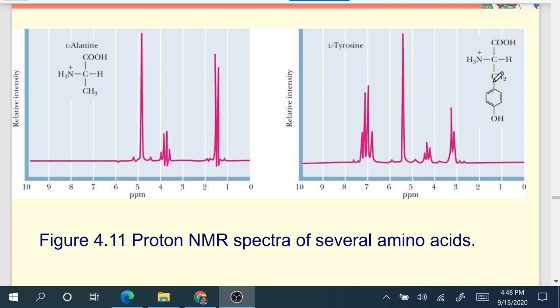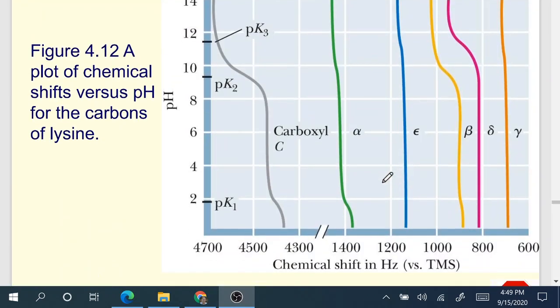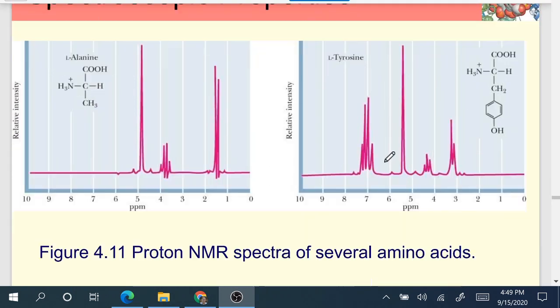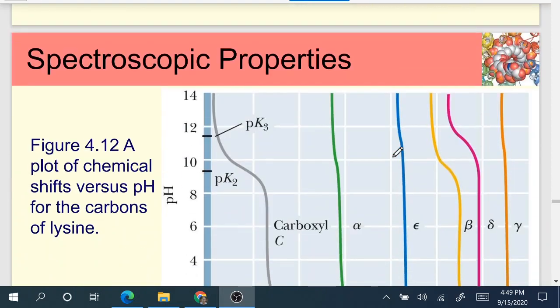We've got these CH2s, okay, and they're in a doublet because they have 1 neighbor here. I don't see the OH for the tyrosine here. Depending on what solvent we're in, we may not see that. Okay, but again, you're not going to have to elucidate these structures unless you're doing research with this or something, I don't think, for this semester.